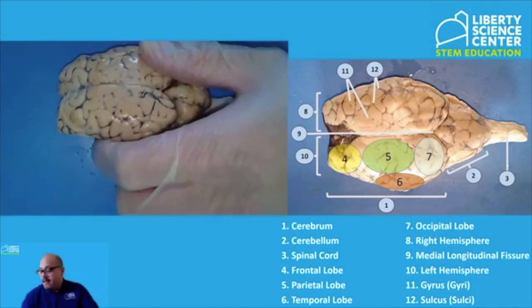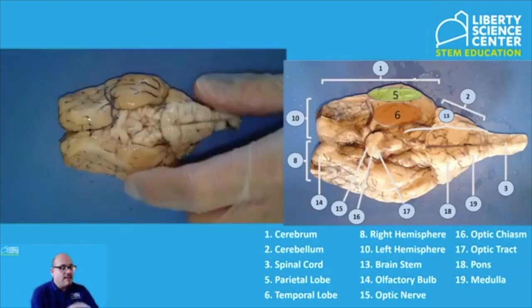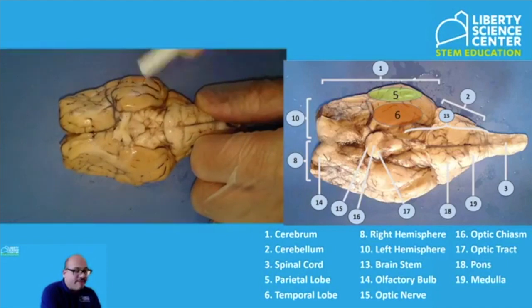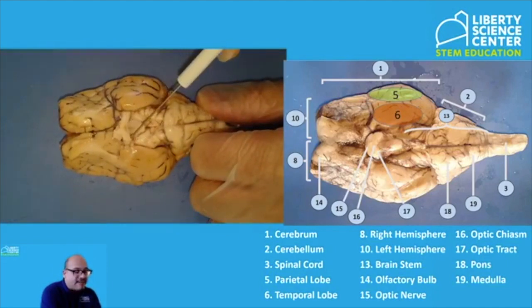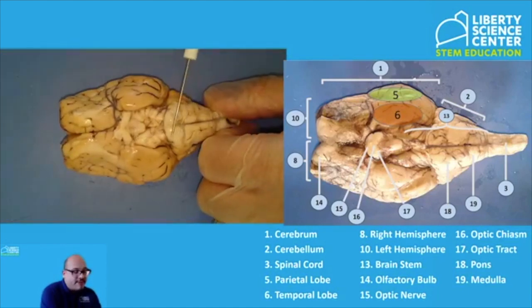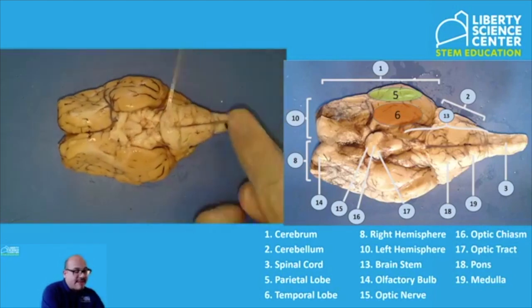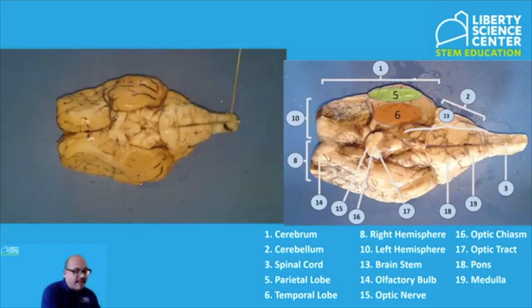Okay? And real quickly, on our ventral anatomy, we have the olfactory bulbs, the optic nerve, the optic chiasm, the optic tract. All right, we have the temporal lobes on the sides here with the frontal. So now we have the right hemisphere here, the left hemisphere here. We have the medulla right here. We have the pons, and then that region's the brainstem, and then we have the spinal cord.